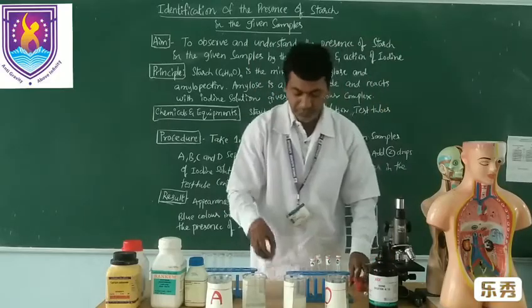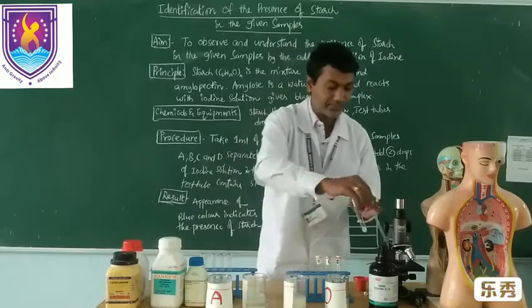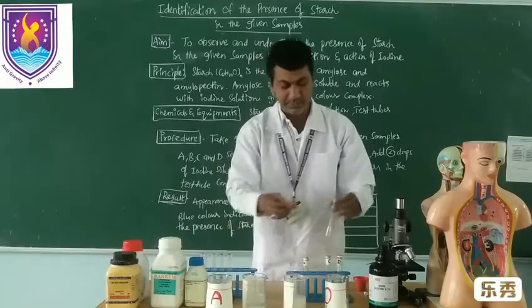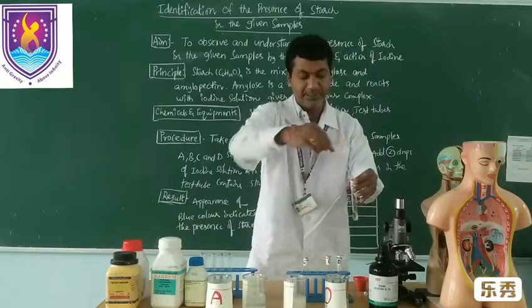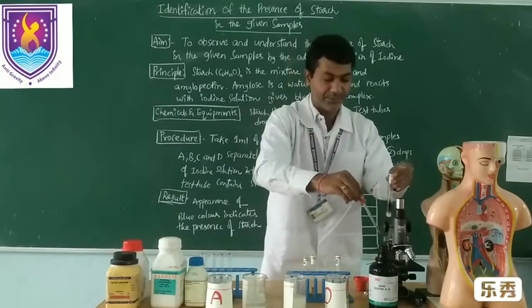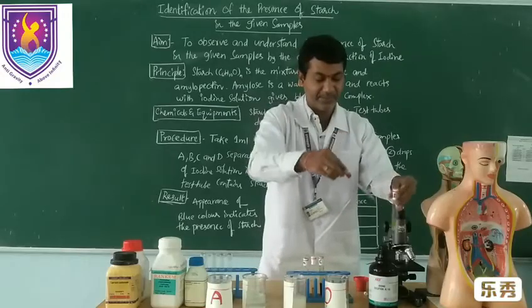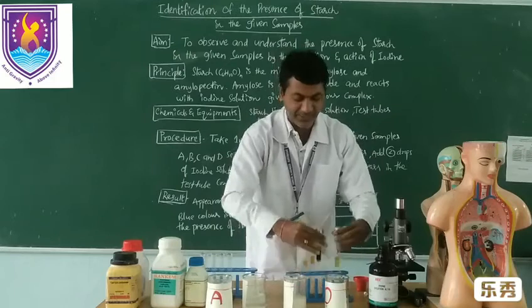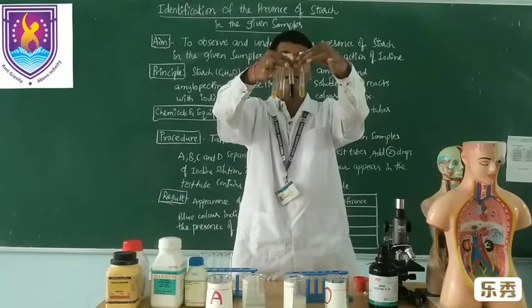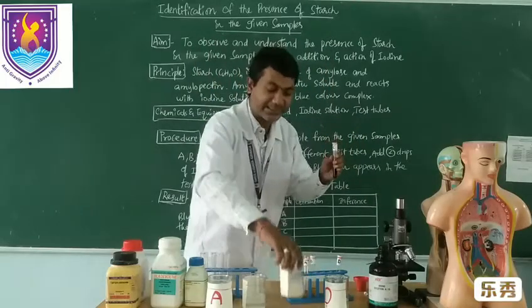Now I am going to add two drops of iodine to each test tube. So adding — and later we can observe. Adding iodine to D as well. So observing: D shows a bluish colour. Now let us see — sample C, this also turns into bluish colour. Let us confirm it. Among these four test tubes, these three — A, B, and D — appear in a light red colour because of the iodine colour. But now sample C turns into bluish colour because the C sample contains starch.